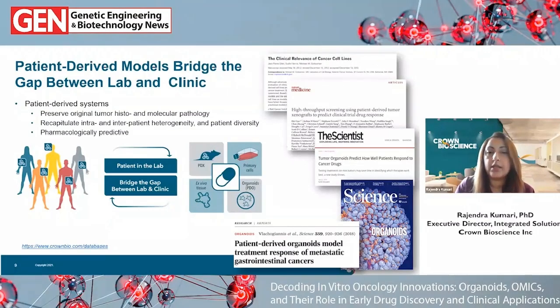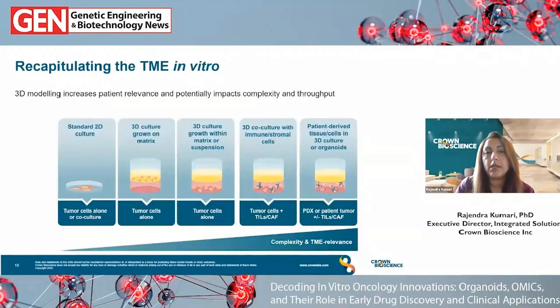So today I'm going to focus just on the in vitro, and I'll spend a bit of time defining those organoids and the 3D assays in a bit more depth, their applications and their uses, together with the 2D cell lines, and also applying those downstream omics tools. But we do need to take a step back a bit and look at what we mean by patient relevant, and also recapitulating that tumor microenvironment in vitro, because it's not the same as carrying these studies out in vivo.